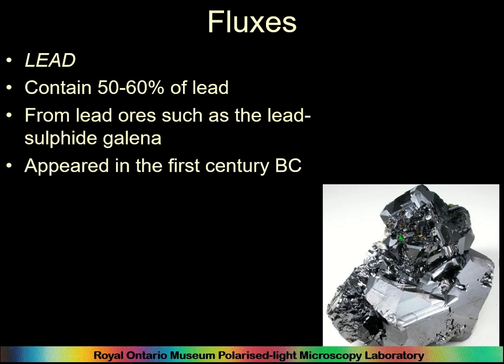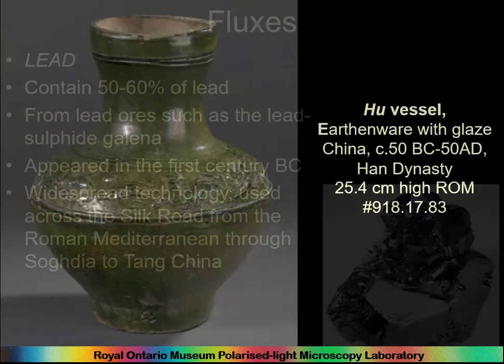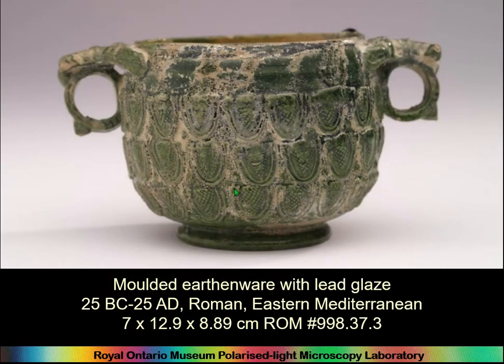Appeared in the 1st century BC, and it's a very widespread technology. I don't think anyone really knows who started it, because it occurs in the 1st century BC from China to the Mediterranean, and someone must have come up with it, or one assumes. Here, for instance, is a nice Chinese one from China, and here's a nice Roman one from the East Mediterranean.